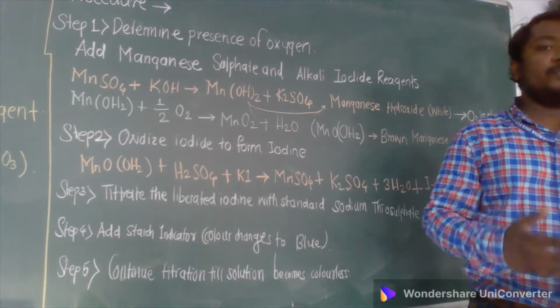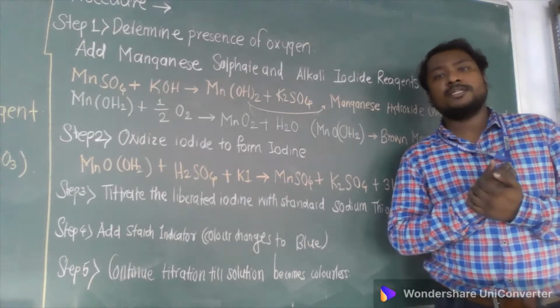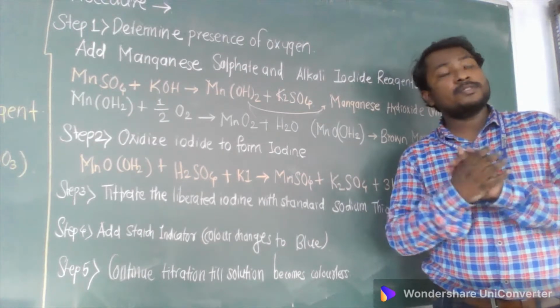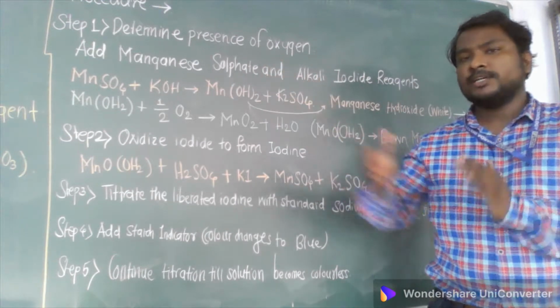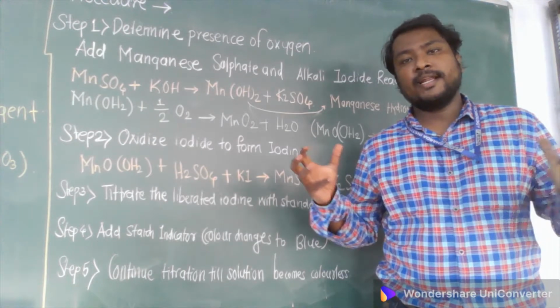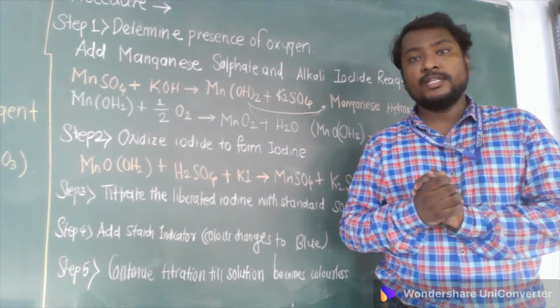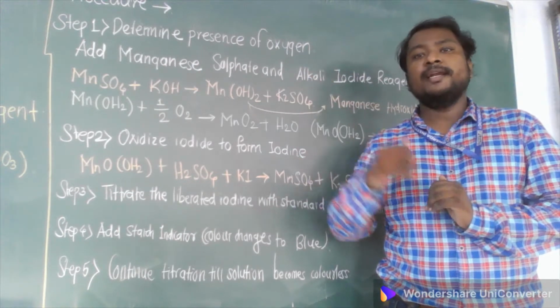As I have discussed with you in our theoretical session, this is a reaction process in which all the chemicals are used, and those chemicals will react with each other, and finally after the reaction they are going to liberate the iodine, and this is nothing but the reaction releasing iodine.